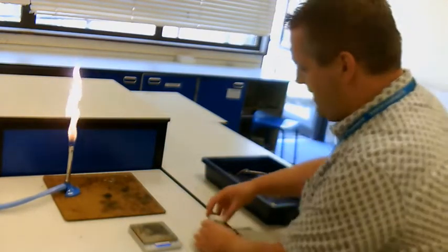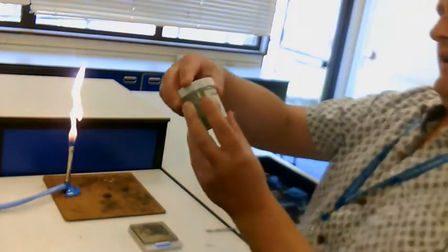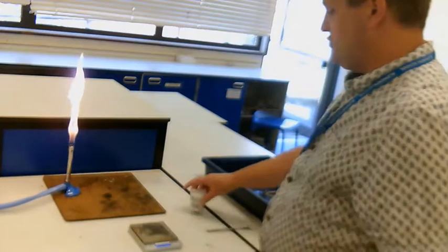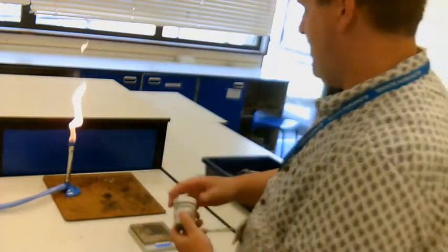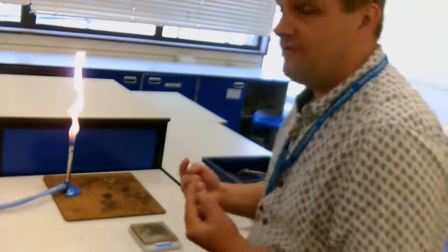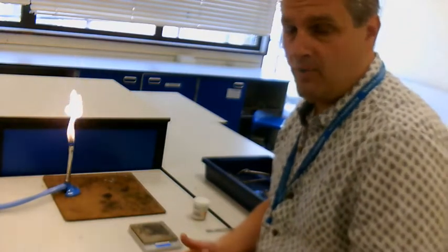We have a chemical here called, I'll show it to you, it's not very clearly written, copper carbonate, which is copper, carbon and oxygen all stuck together in one compound. When you heat this, it goes through a reaction called thermal decomposition. If we break that apart: thermal, heat; decomposition, break apart. So thermal decomposition means break apart with heat.